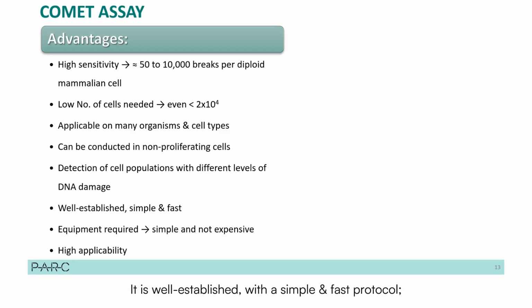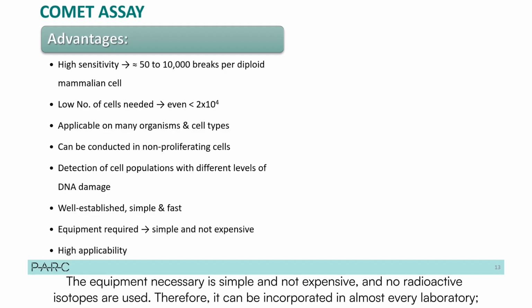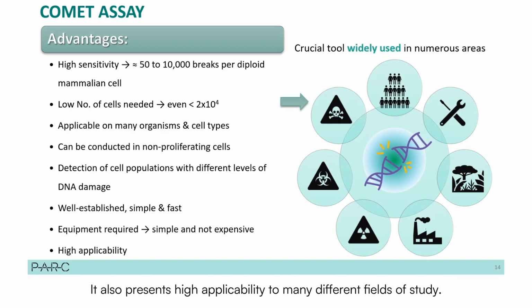It is well established with a simple and fast protocol. It has high versatility and flexibility. The equipment necessary is simple and not expensive, and no radioactive isotopes are used. Therefore, it can be incorporated in almost every laboratory. It also presents high applicability to many different fields of study.